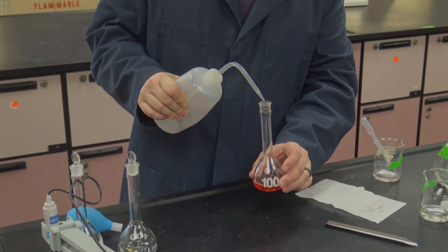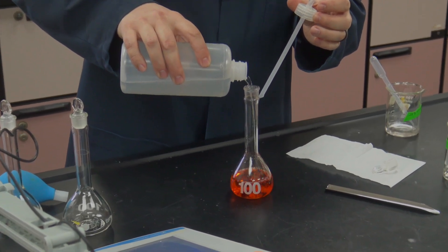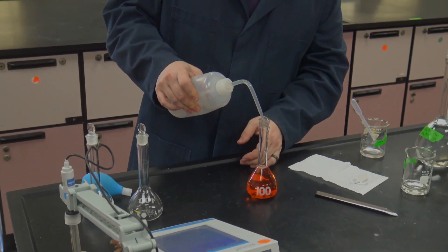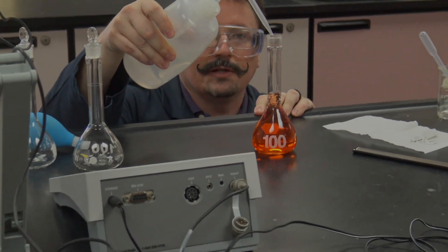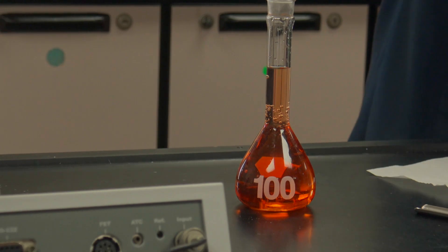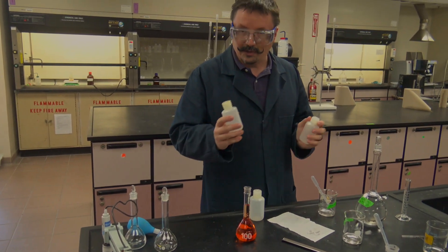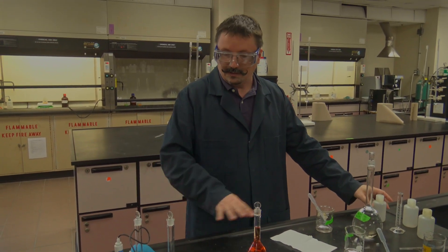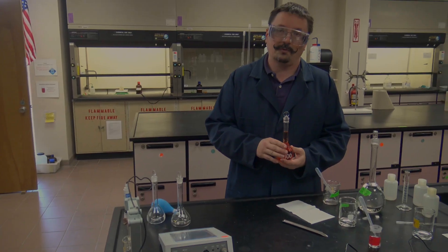After adding everything, dilute to the mark. Remember you need four standards plus a blank. Your blank contains everything except the analyte — so it has everything except iron: one drop of sodium citrate, plus the same amounts of hydroquinone and phenanthroline as your standards. Since you only have three volumetric flasks but need at least six solutions, make the first three, transfer them to the poly bottles, rinse the volumetrics, then make the 1 mL standard and blank, transfer those, and now your volumetrics are free for your unknown sample.